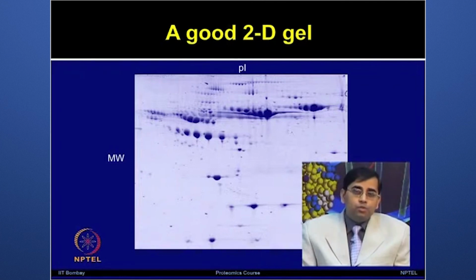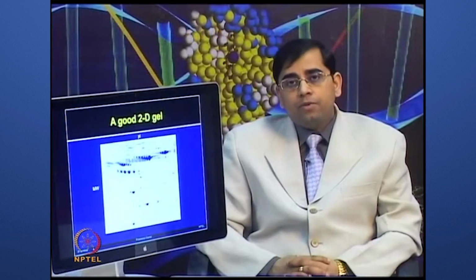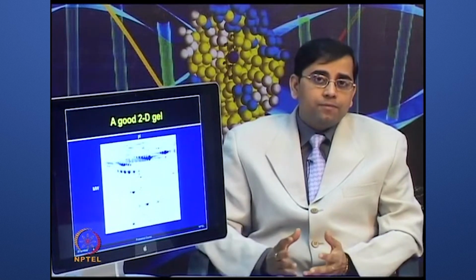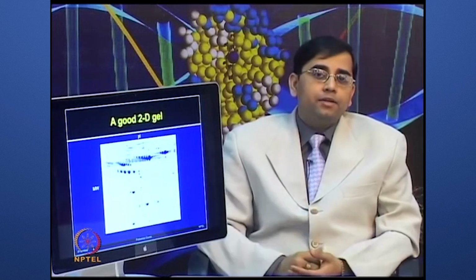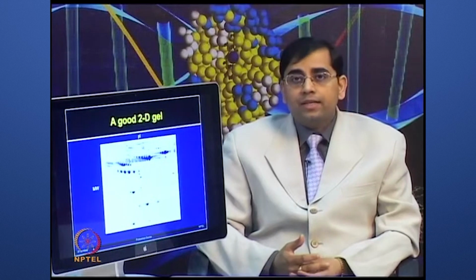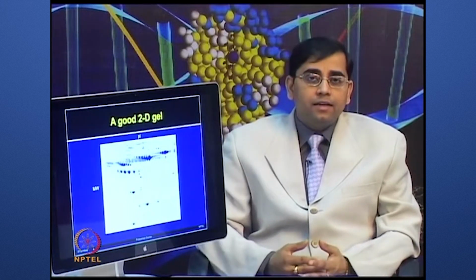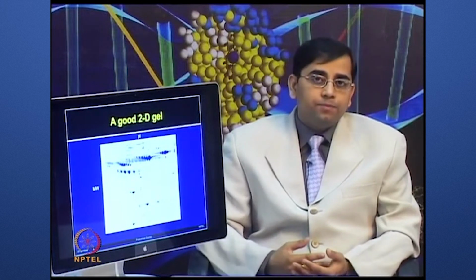Analyzing two gels by using software is not so tedious, but when you are talking about many gels, where you have a large number of controls and a large number of treatments, then it becomes very challenging, because all your gels should have run at the same time with the same migration. But many times that is not the case. You cannot run 50 gels or 100 gels in a given day. So, there will be some manual artifacts, some day-to-day variations.